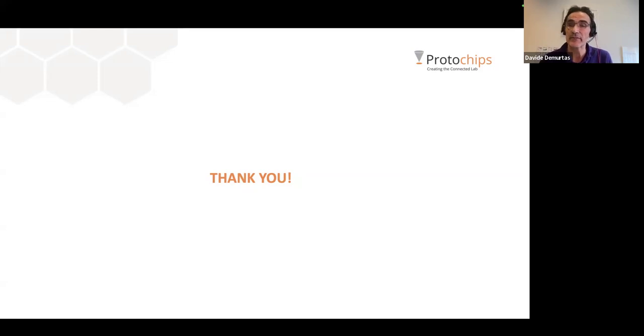I have a question for you, Madeline, concerning biological samples. Using the dropcast method, we are able to create different thicknesses of the liquid in the micro wells in the bottom chip and then after we cover with the top chip. But the question is, when we work with flow mode, do you have a method to control the thickness? Because the thickness is very important for biological samples, and then the signal is really weak.